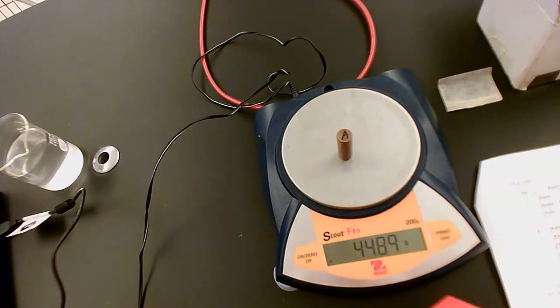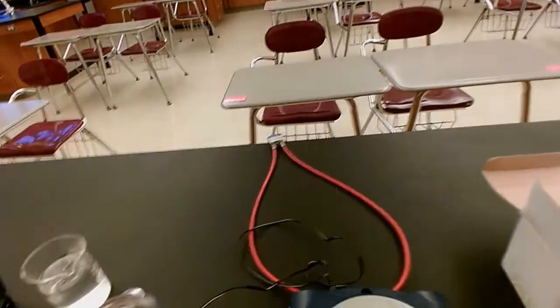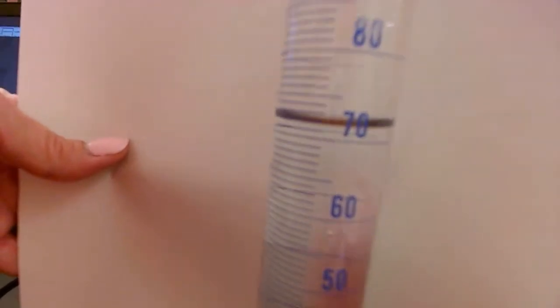Now we're going to get the volume. Remember the volume, it's better if I hold a white sheet behind it for you to see better. Now when you're getting this volume, this is just the volume of the water. So that's where you record this. I'm going to hold it up there. And right there is your volume. So make sure you record that. That's an easy one to see, huh? So that's the volume of your water.